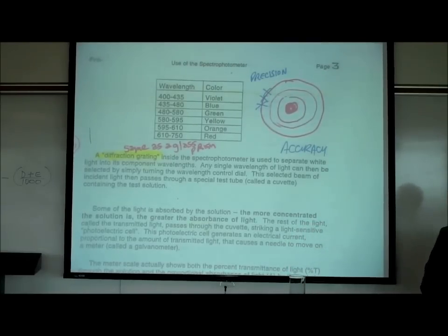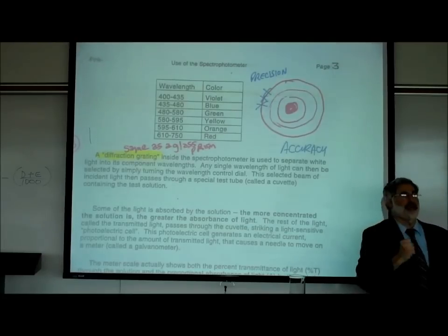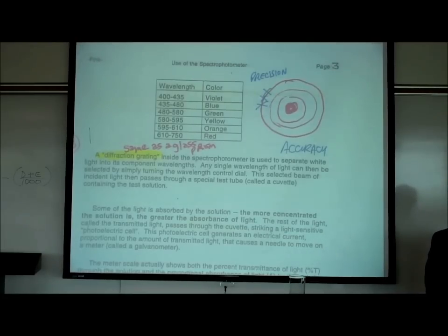And you probably noticed that if you weighed it 3 times, you probably got 3 different weights. Why don't we get perfect weights each time? Our scales are not perfectly accurate or perfectly precise, and neither are we in even reading the scale.